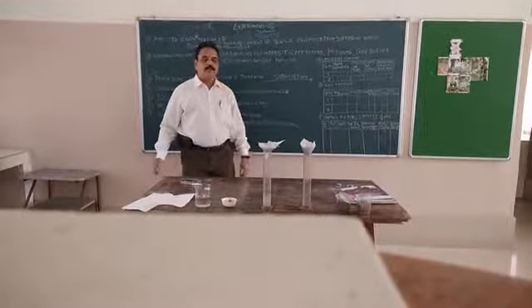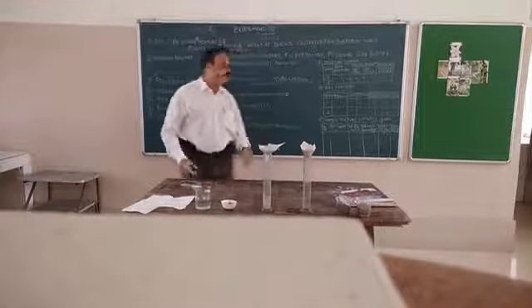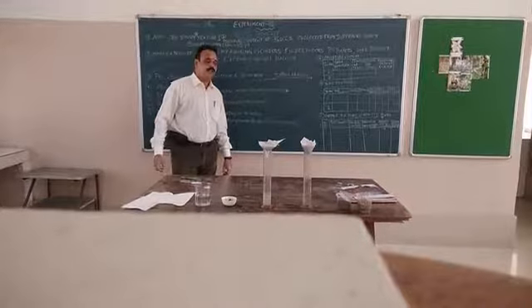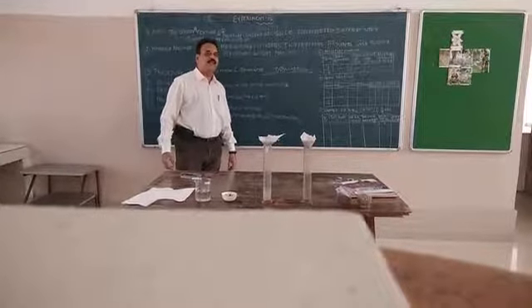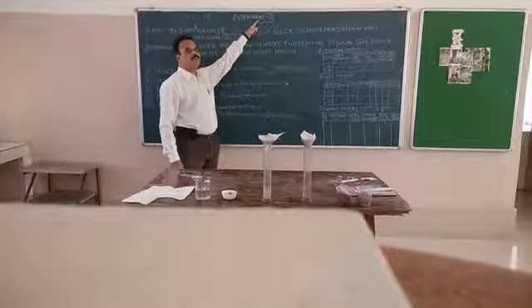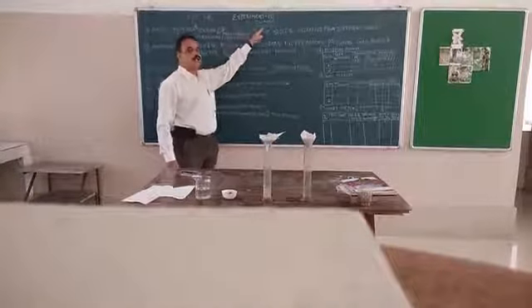Today's practical demo is meant for class 12 students. In our previous session, we talked about pollen germination. I gave a demo about that. And today, in this session, we are going to do experiment number 2, that is soil quality.